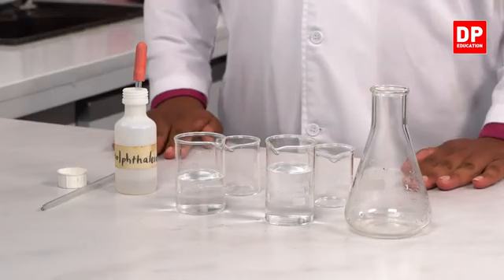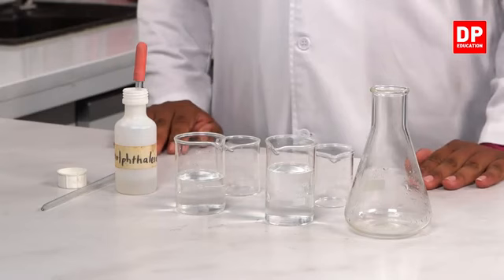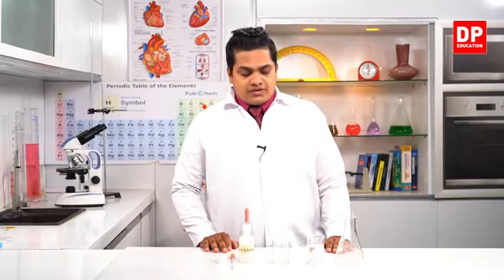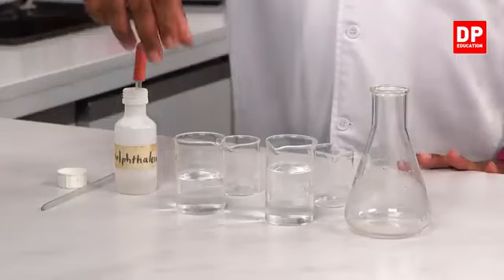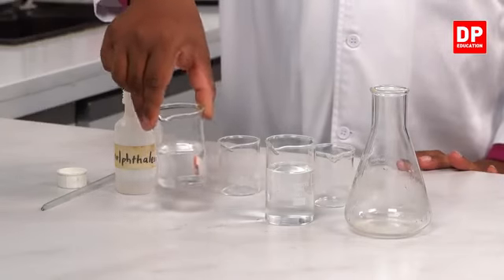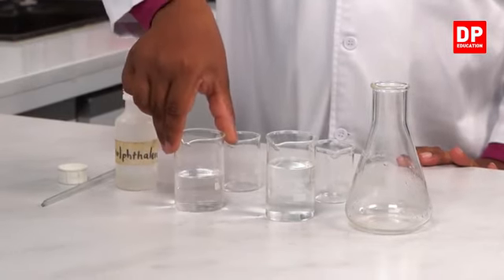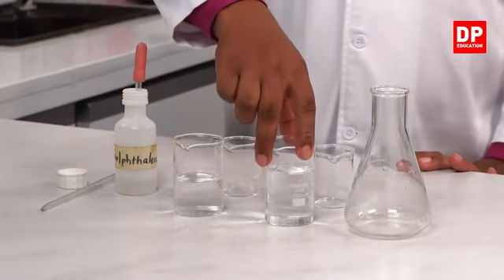So I have these materials with me. We are going to conduct a small experiment to show that the neutralization reaction occurs, or substances get neutralized, when you add an acid to a base. First of all, I'll need some sodium hydroxide solution. Some HCl solution.